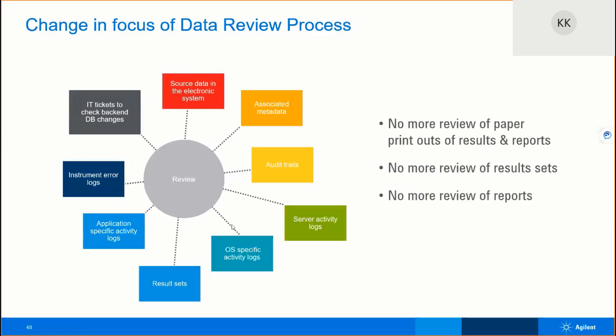If you have an audit and a review is happening, then what the reviewers look at really is the source data in the electronic system, the associated metadata, audit trails, which is a big focus of the FDA, server activity logs, operating system activity logs, result sets, application specific activity logs, instrument error logs, IT tickets to check backend database changes. So a really holistic review is now happening.